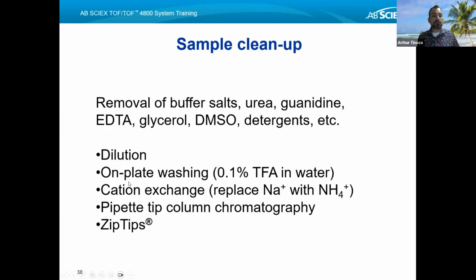You can also do what's called on-plate washing. I haven't personally done this, but supposedly it can work. You crystallize your sample on the plate, and then you use some 0.1% TFA in water and pipette that up and down on the sample, and that's supposed to remove the contamination. My fear is that you might actually dissolve something that you're interested in.